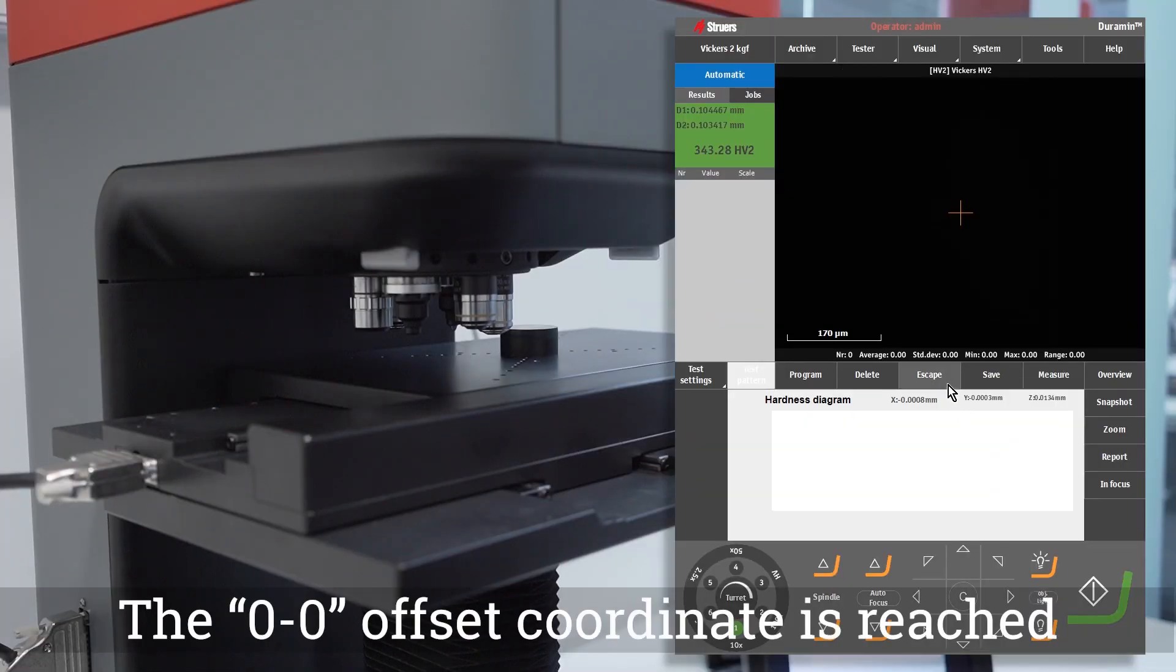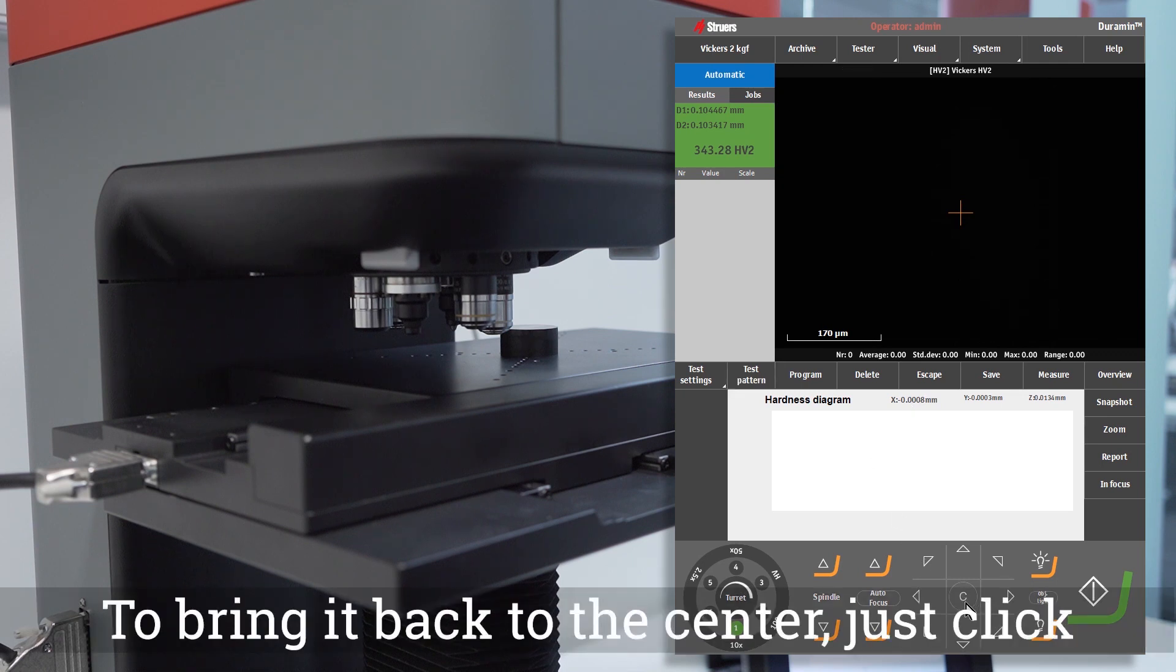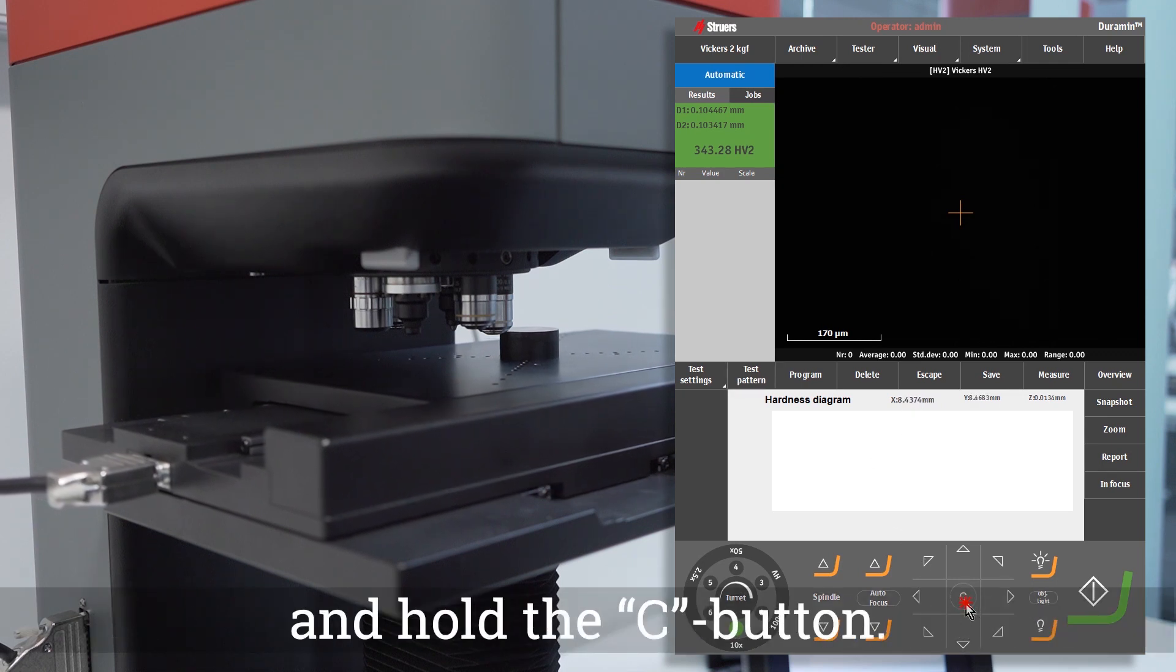The 0-0 offset coordinate is reached when the stage moves all the way up to the right. To bring it back to the center, just click and hold the C button.